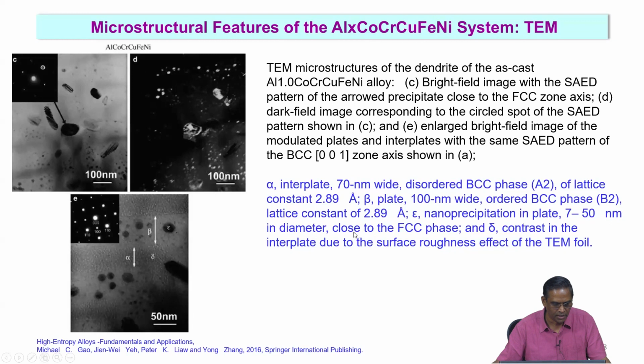Okay, so what you are seeing, of course, in all these contrast mechanisms, is basically because of the diffraction contrast, right? Not any other mechanisms.